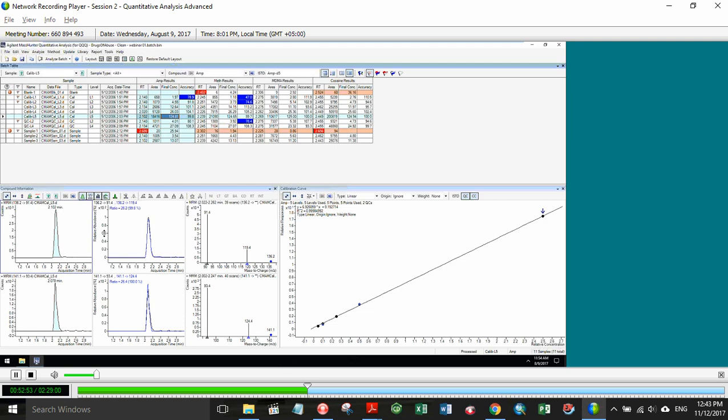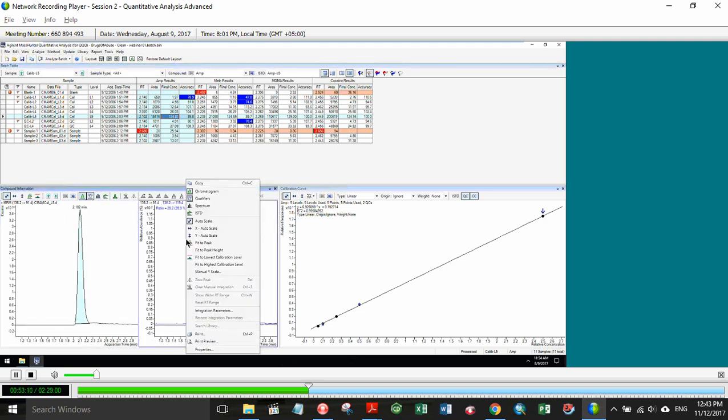Showing some of the properties of this window, I'm with Steve on liking that it's good to have the option to see the qualifiers either as normalized or as they really are in relation to the quantifier ion. So I like that view compared to the old style view.